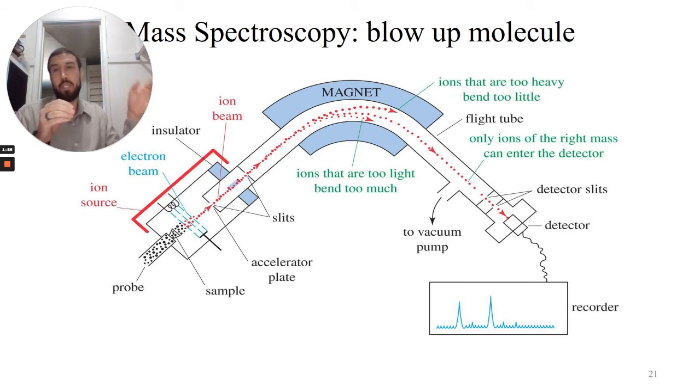And so that's the rest of the instrument. You get a nice long tube, you get a carrying gas that helps push each of those particles through. The smaller, lighter pieces will move much faster because they're smaller and lighter. The heavier pieces will take a little bit longer. Okay? The other part that shows up in your mass spectrometer is this magnet.